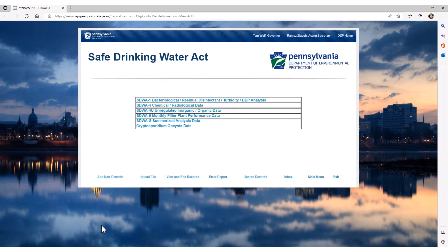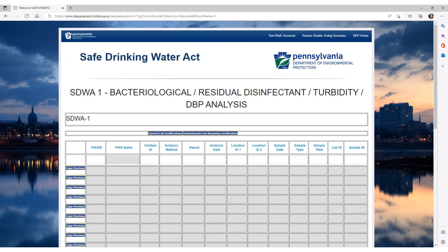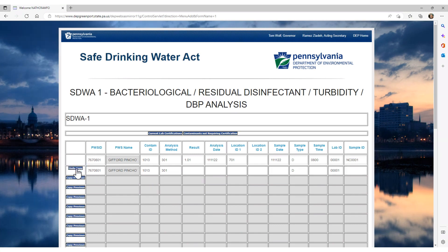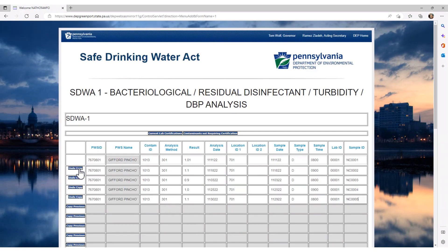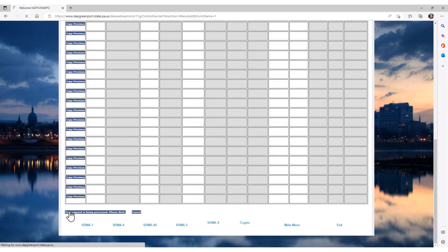For our example, we will use the SDWA-1 form, and we will be entering data directly into DWELLR. These features apply to data that is uploaded as well. You will begin entering your data. After you have entered your first line of data, you can use the Copy Previous button, which will help ensure data accuracy. Here we have entered our five new records. Now we will scroll down to the bottom of the page and click the Submit button. Remember, be patient and only click the Submit button once.